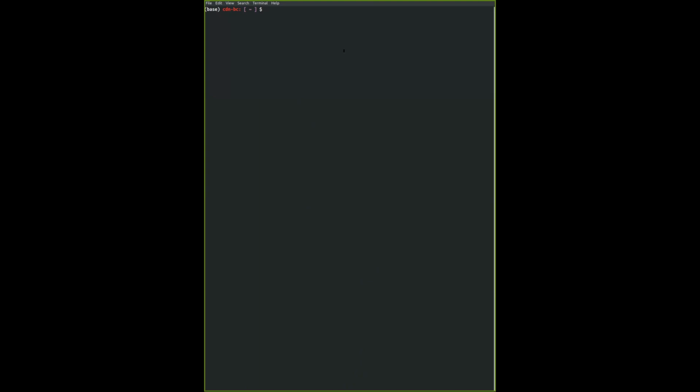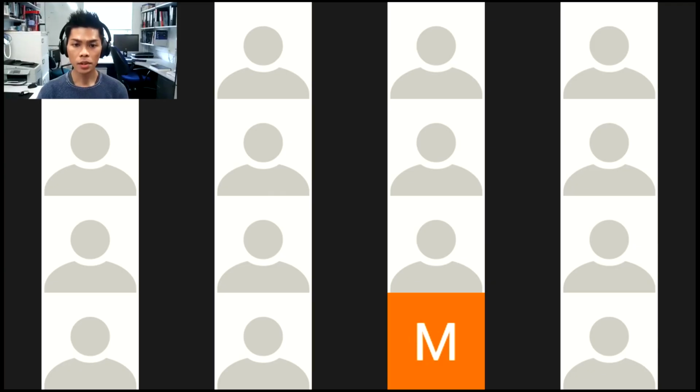And Farsham, yes, Benedict, can you just show me, because I got a little bit slow. Could you show me again how to copy those files? Yeah. So okay. Do you see the? Okay, I'll show you again on the page. Don't worry. And share on here.